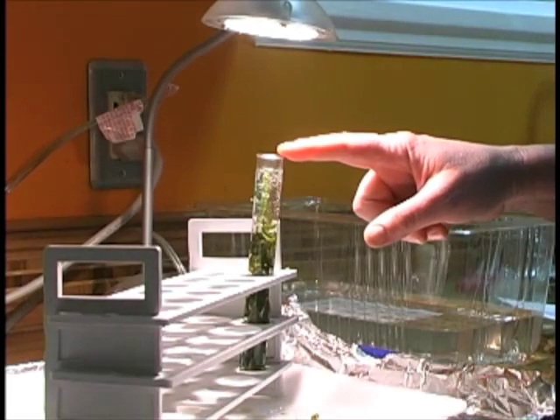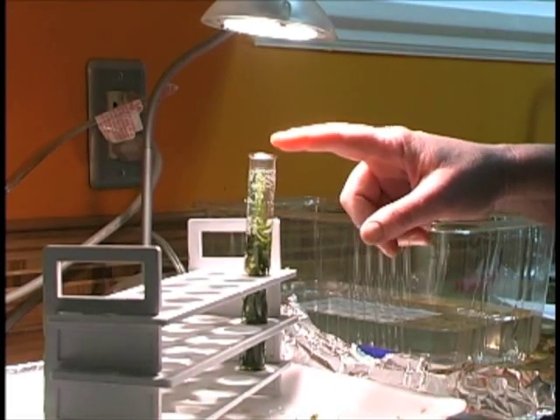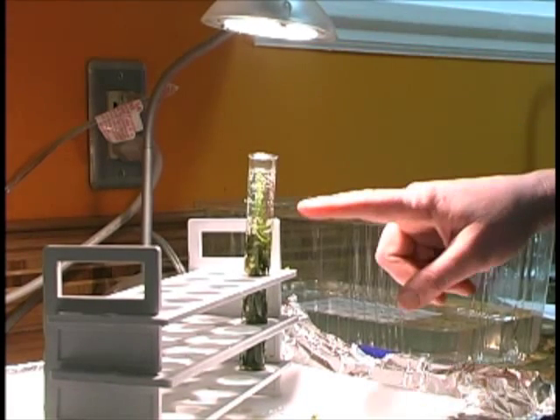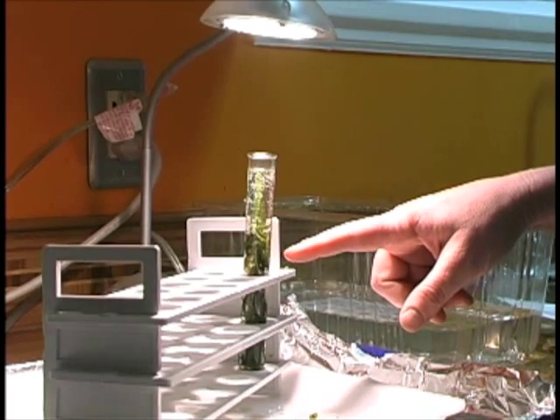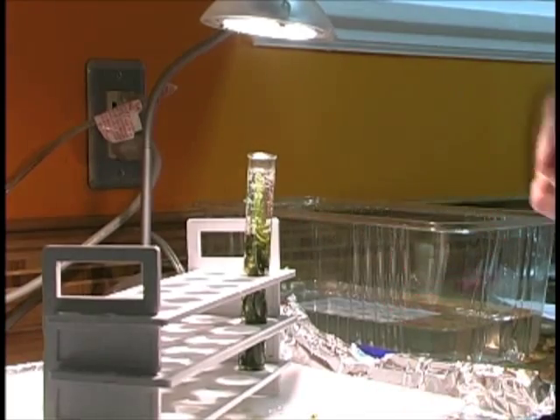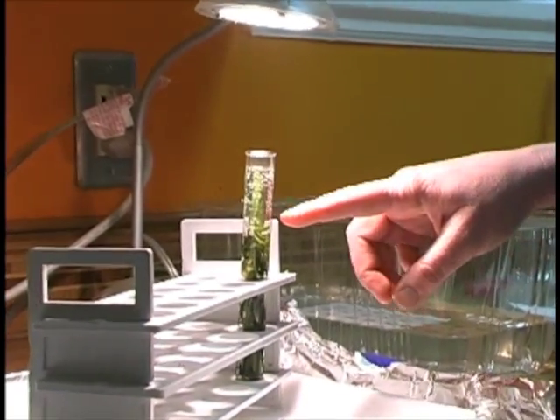Now that I have my prepared Elodea in the tube, I've put it under a light because I'm working at night. I'm going to let it start to photosynthesize a little bit, and then I'm going to start to time. I'll time for one minute.